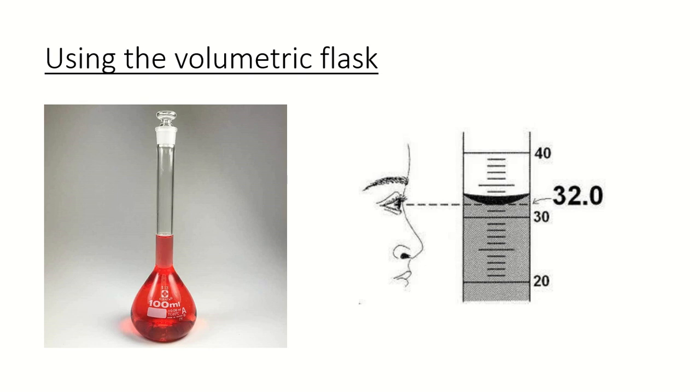Also, when you're looking at the meniscus, you want to be exactly at eye level, like the diagram on the right shows. If you're not at eye level, it's going to be unclear, you can make mistakes. So, again, very, very important for standard solution in a volumetric flask, we need the meniscus to sit on top of that graduation mark. And as you're adding that distilled water, you're going to want to use a pipette towards the end so we don't go over.